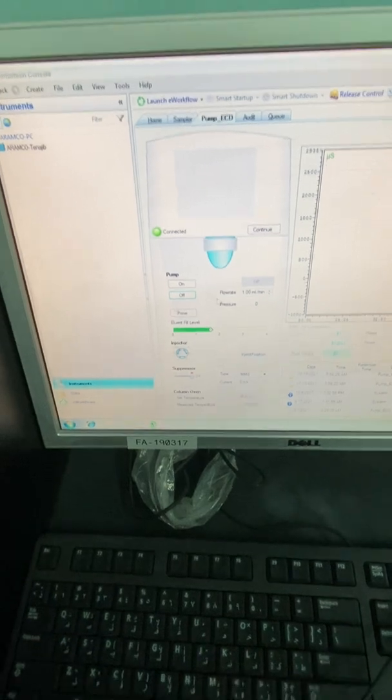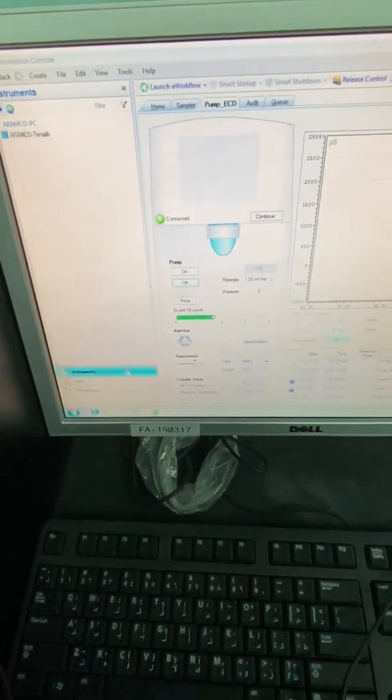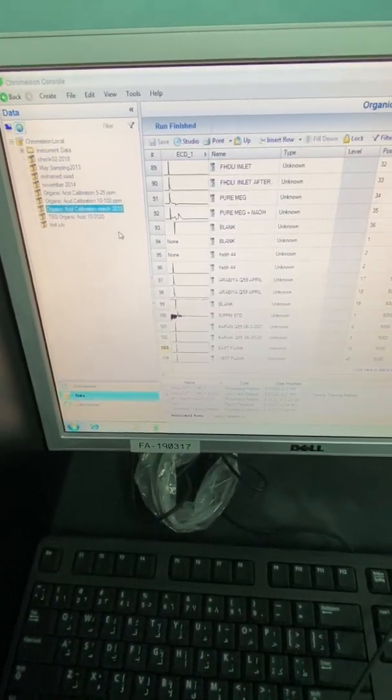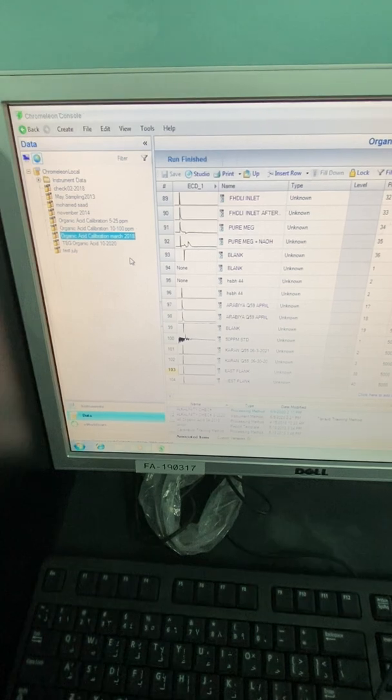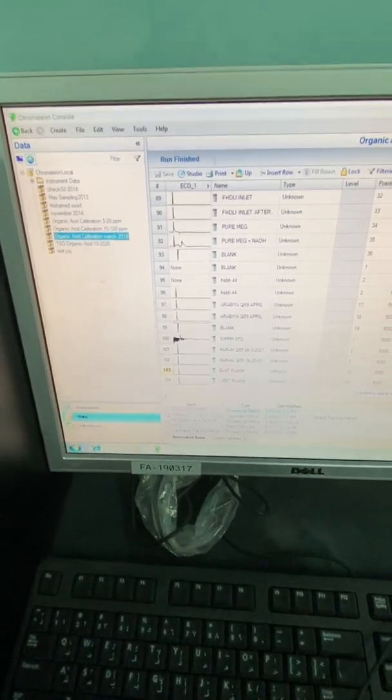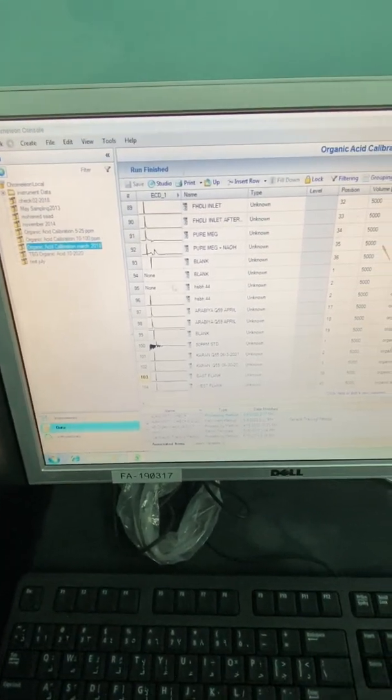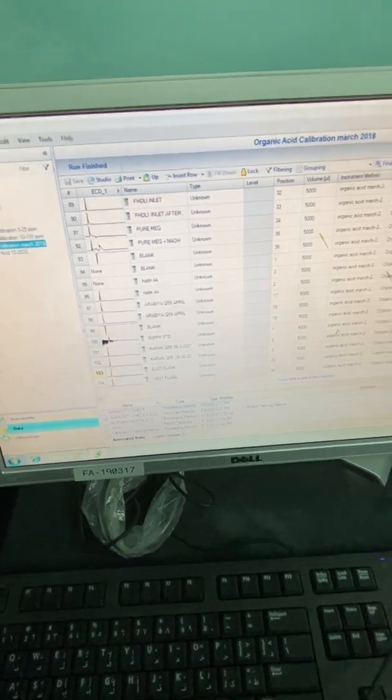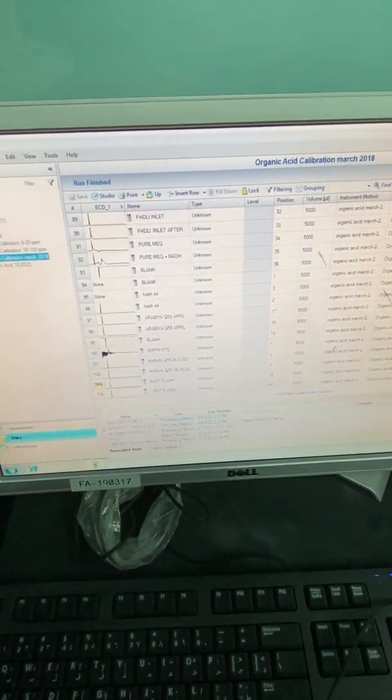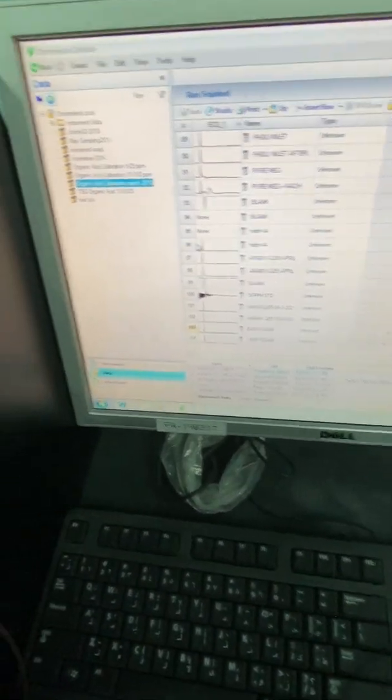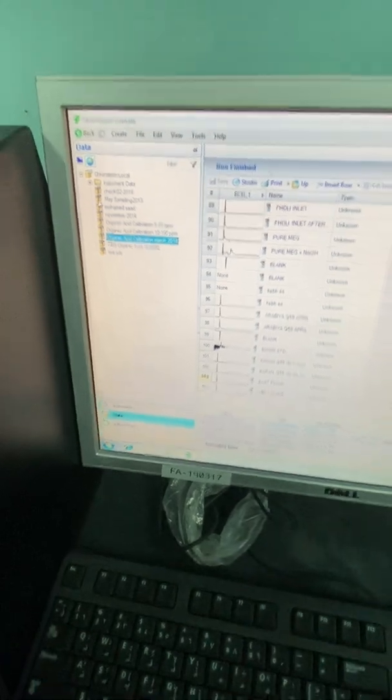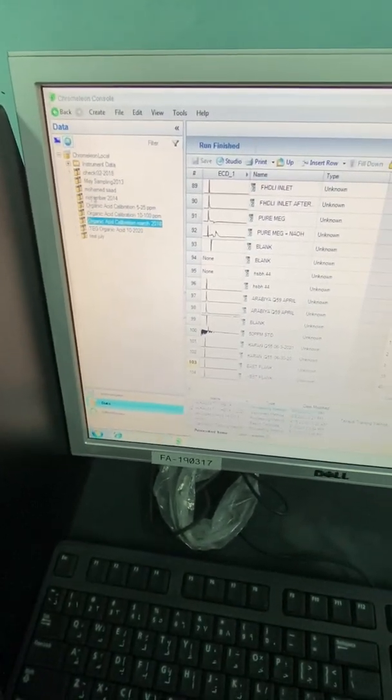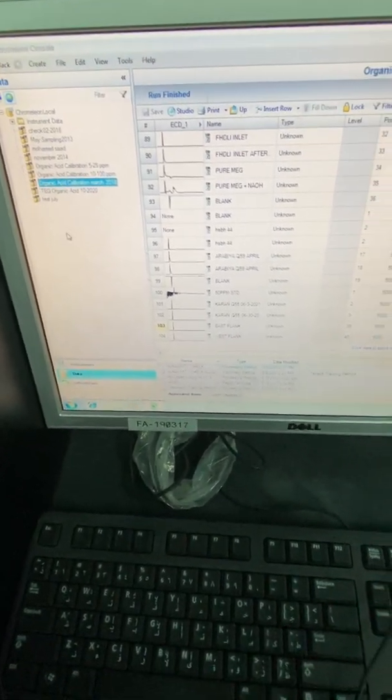All of these parameters depend on your method that you can create it by pressing the data here. This is the sample injection or the injection list from where you can inject your samples. And these are your methods already saved or the process method.